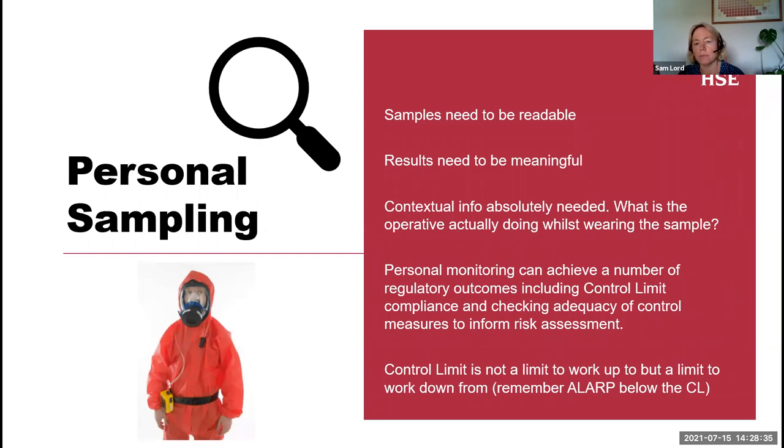So firstly, when you're sampling for asbestos fibres, for those that you're not aware, it's all about being able to see the fibres down the microscope. So if you've collected a load of dust on the filter as well, that will obscure the fibres and you won't be able to read it. So certainly when you are sampling for asbestos, that is a very important issue that analysts need to be aware of. And I think that's possibly one of the reasons why this 1 hour sort of thing has come in, because it's seen as 1 hour being enough before it gets unreadable.